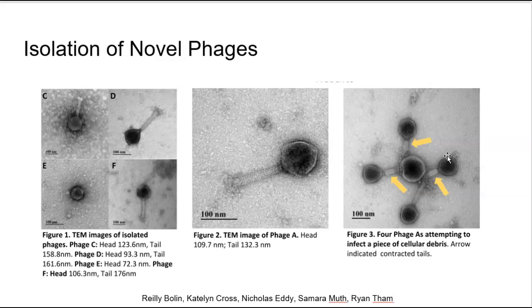So we've got 5 phages here. We've got phage A, C, D, E, F. If you're wondering what happened to B, well, we started to isolate it and it didn't grow out. So rather than relabel our phages, and that would have been confusing with our freezer stocks, we just let B go. So we've got phage A here, and we started characterizing this one in detail first, just because it was the first one. And then we've still got to characterize phage C, D, E, and F.